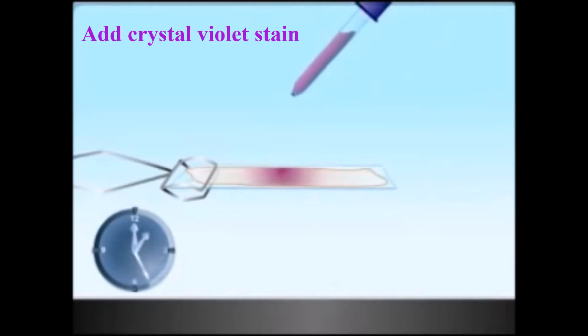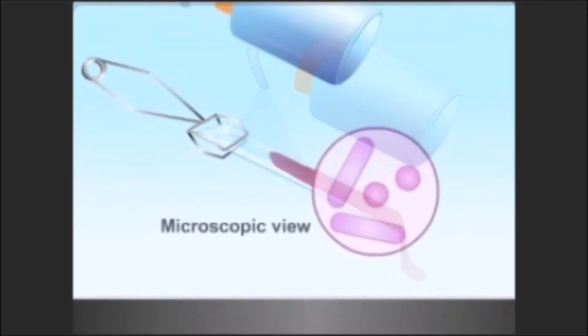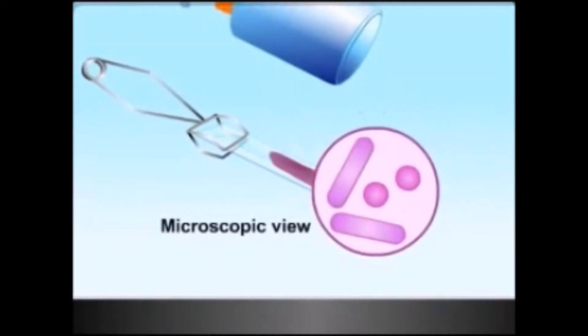Let stand for 10 to 60 seconds. For thinly prepared slides, it is usually acceptable to pour the stain on and off immediately. Pour off the stain and gently rinse the excess stain with a stream of water. Note that the objective of this step is to wash off the stain, not the fixed culture. After this treatment, both gram positive and negative bacteria show violet color in microscopic view. Add the iodine solution on the smear.